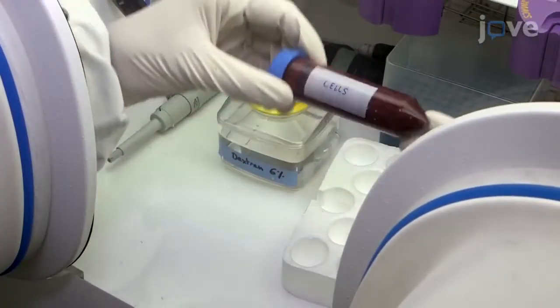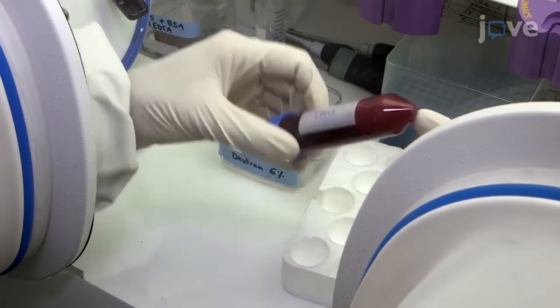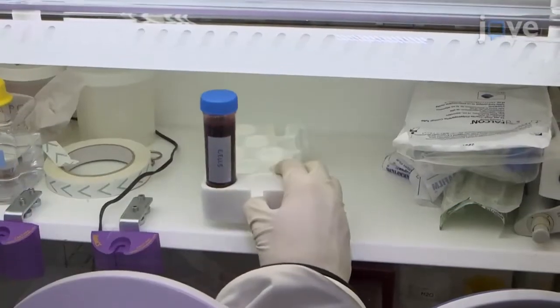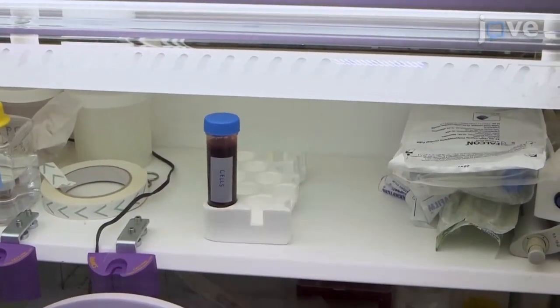Invert the tube 10 to 20 times to gently mix the blood and dextran mixture, and allow the tube to sediment for at least 30 minutes.